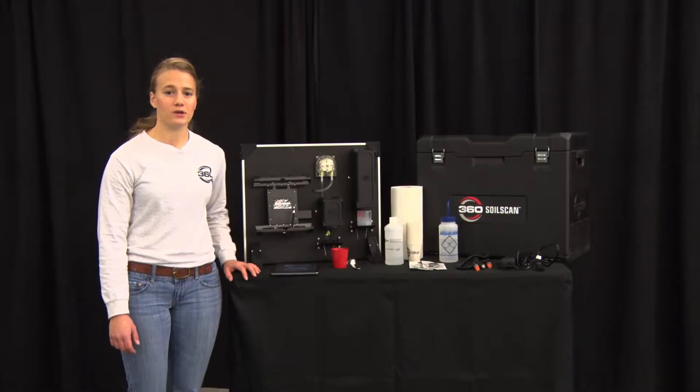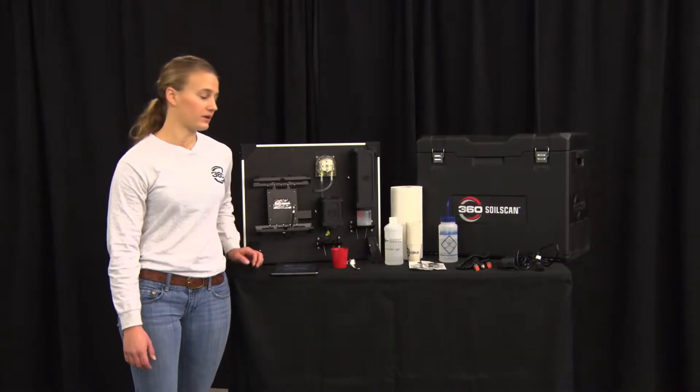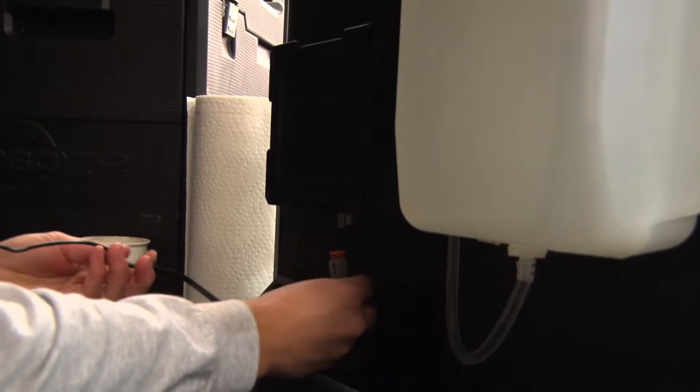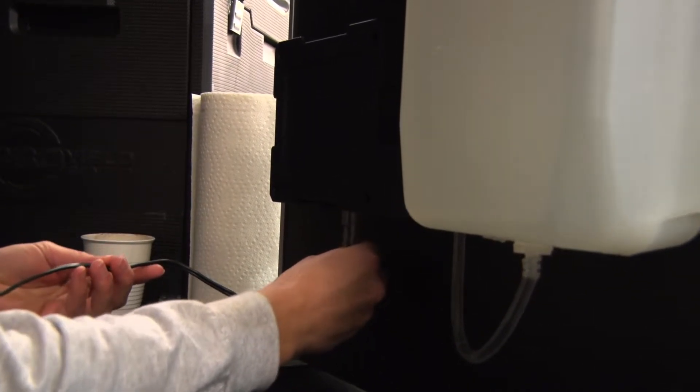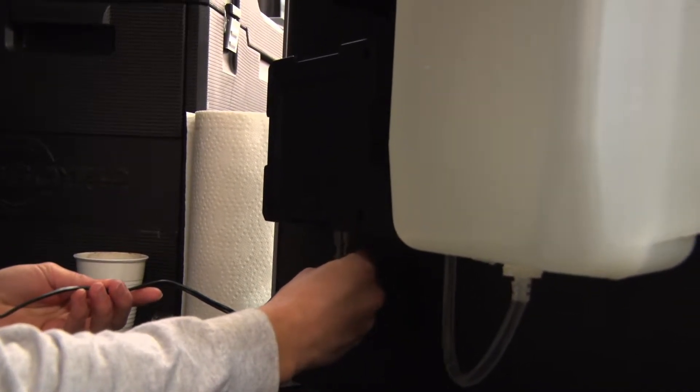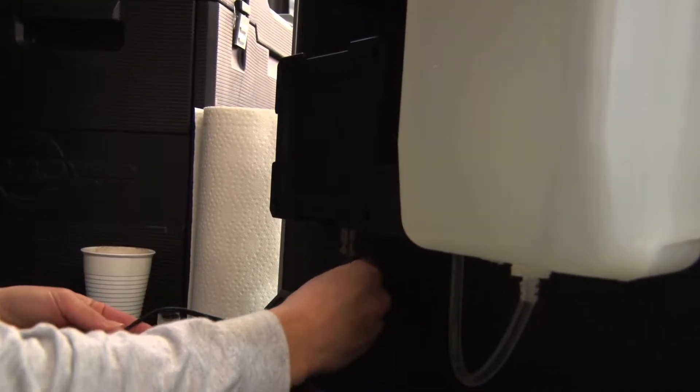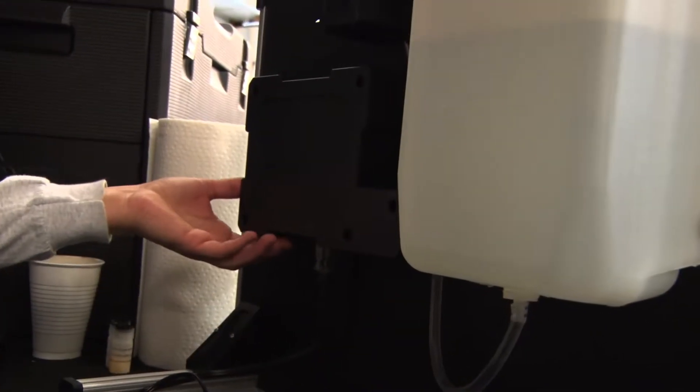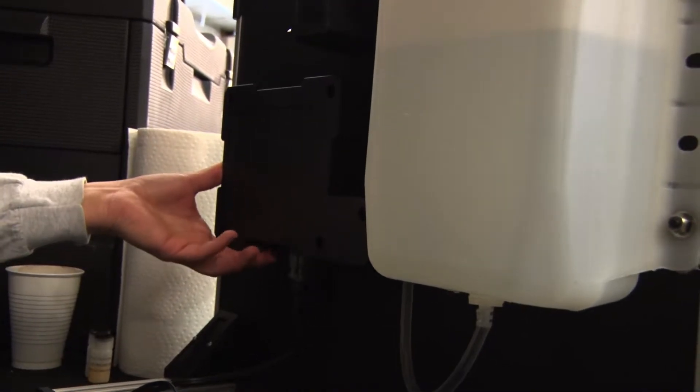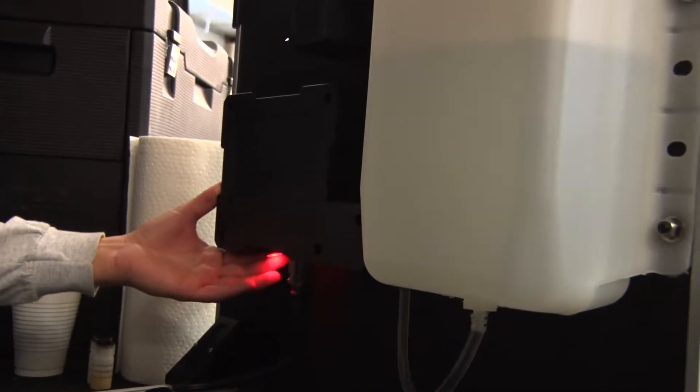While the sensors are soaking we're going to go ahead and apply power to the SoilScan. I'm going to use a wall plug-in to apply power. Remember that you also can use a cigarette lighter in a vehicle. To turn on the SoilScan flip the switch beside the plug-in. It will illuminate red when on.